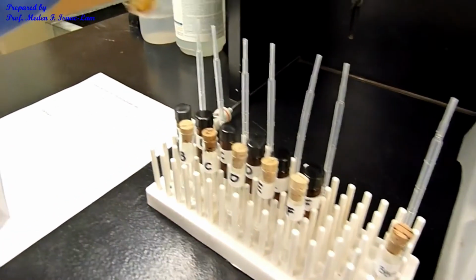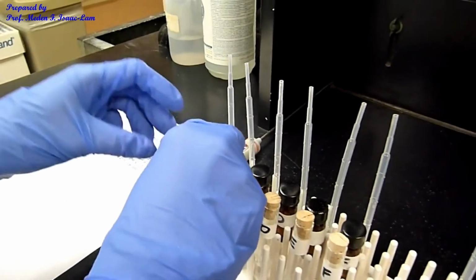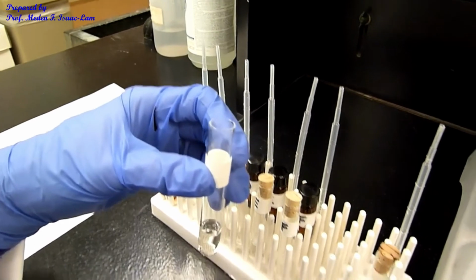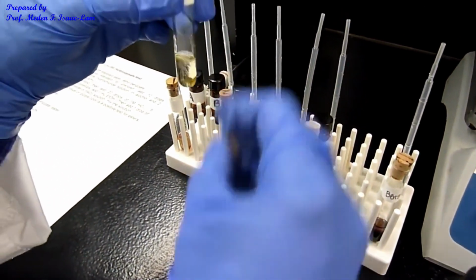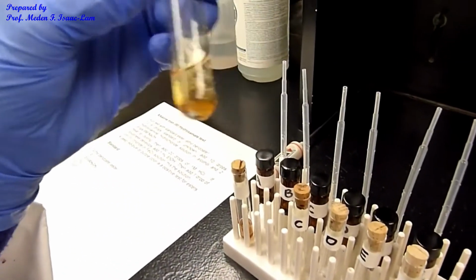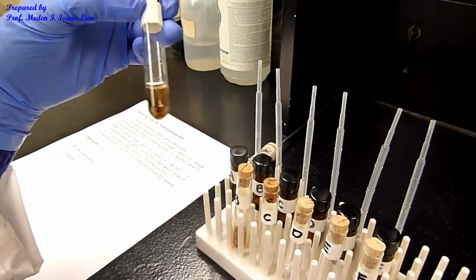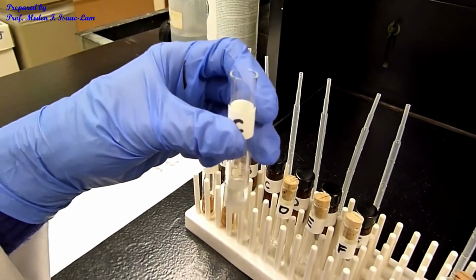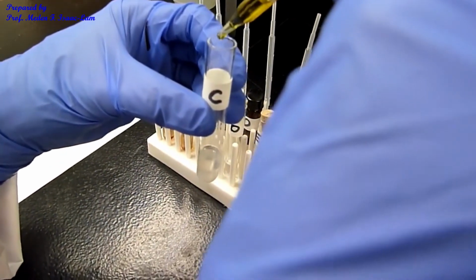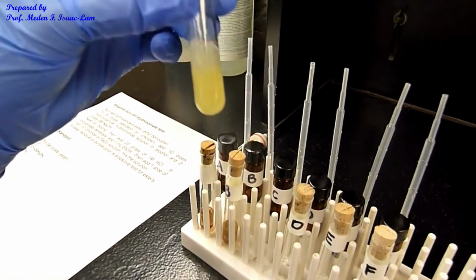So no purple coloration. It's just orange. So we're looking for a purple color. So deep purple. So nothing, it's just reddish. So C, unknown C. So yellowish.